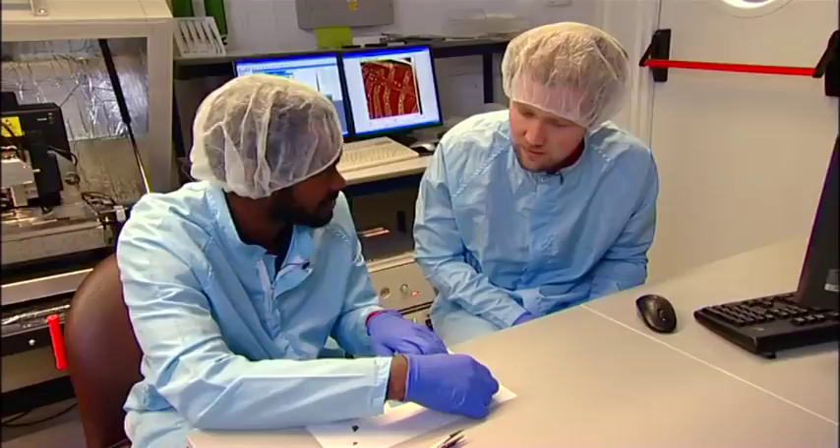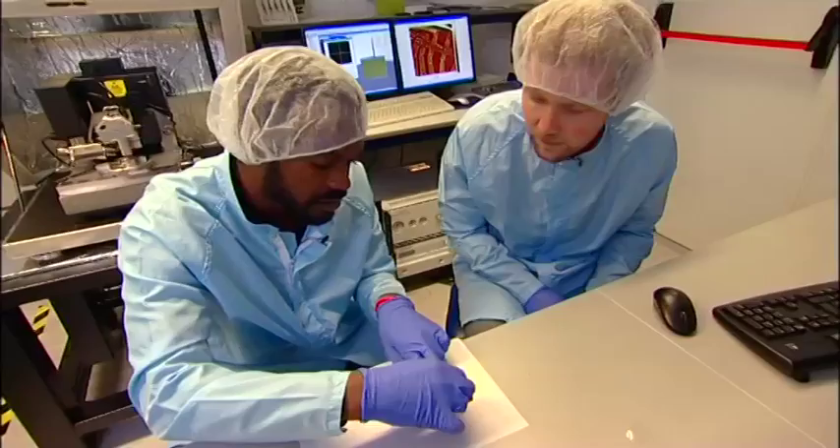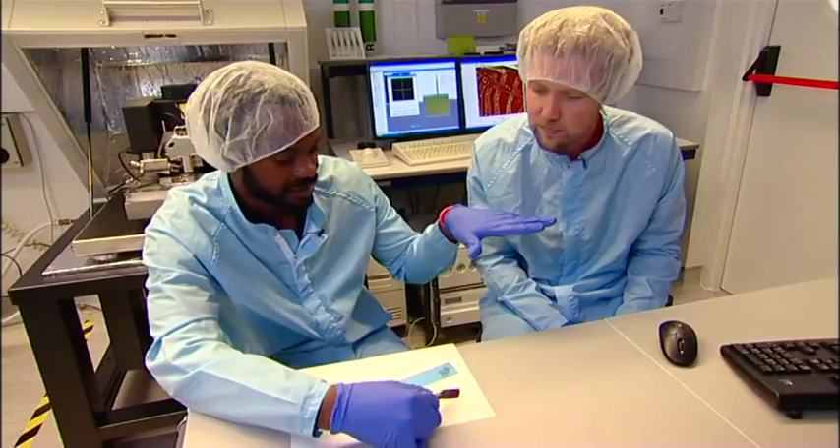So you just slowly remove the tape like that. And you can't really see it with the naked eye. What we would then do is transfer the sample to a microscope where we can have a closer look and inspect the surface.